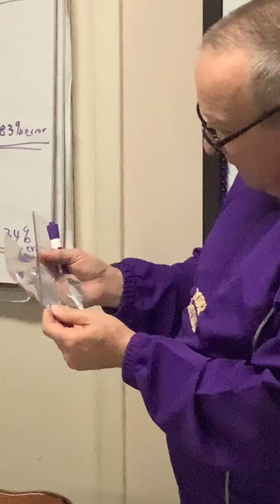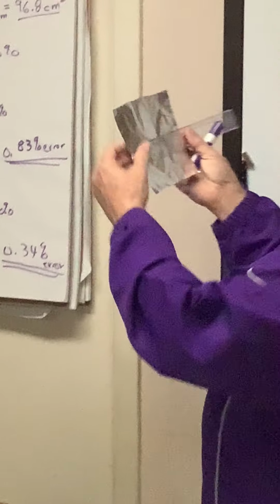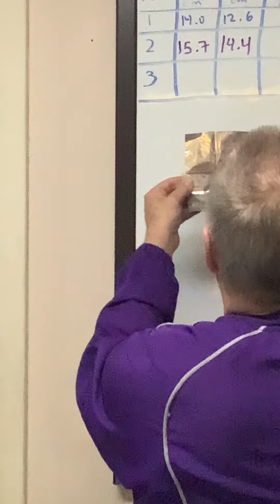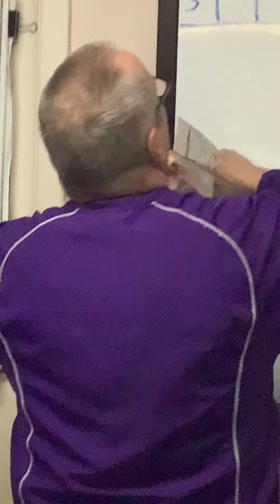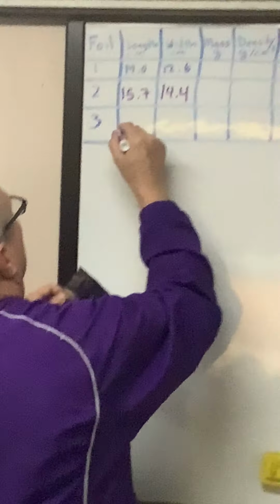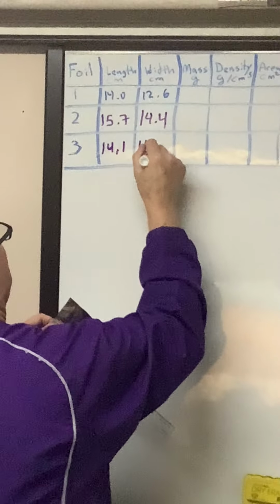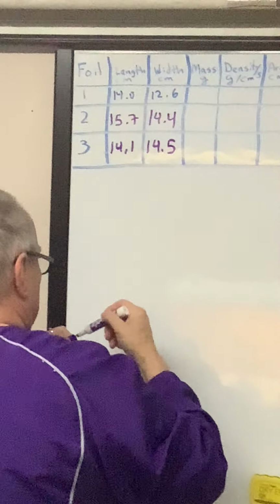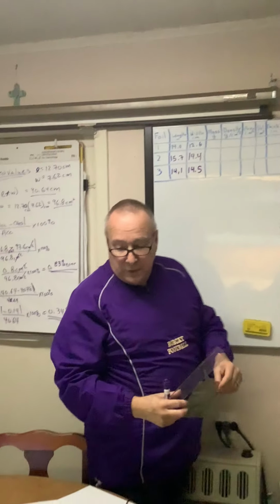It is 14.1 by 14.5. So 14.1 centimeters by 14.5.